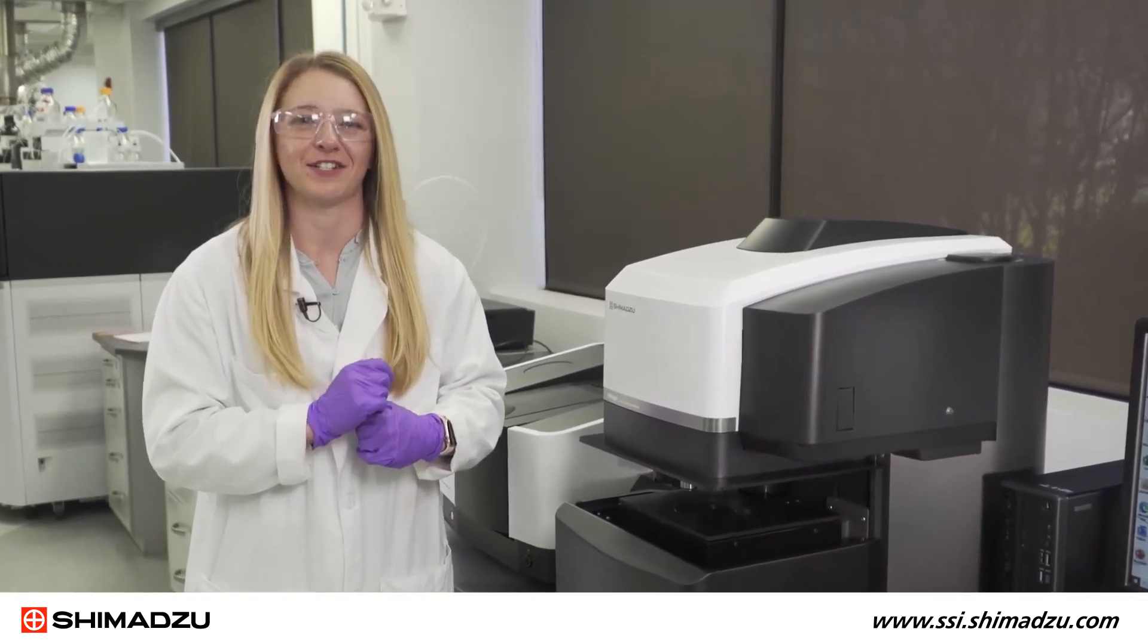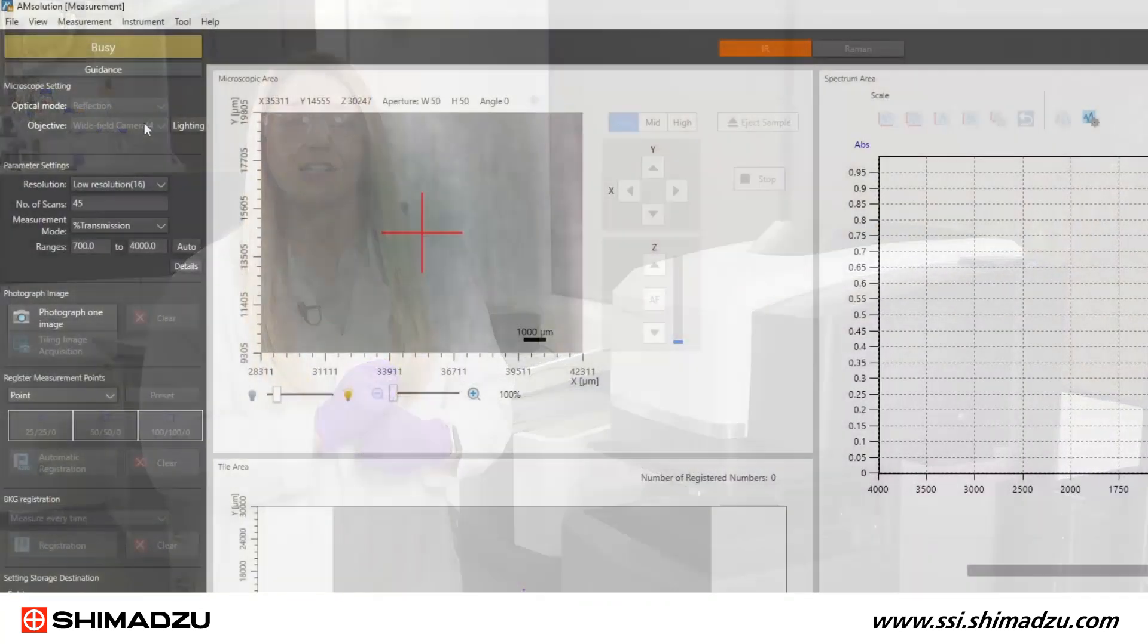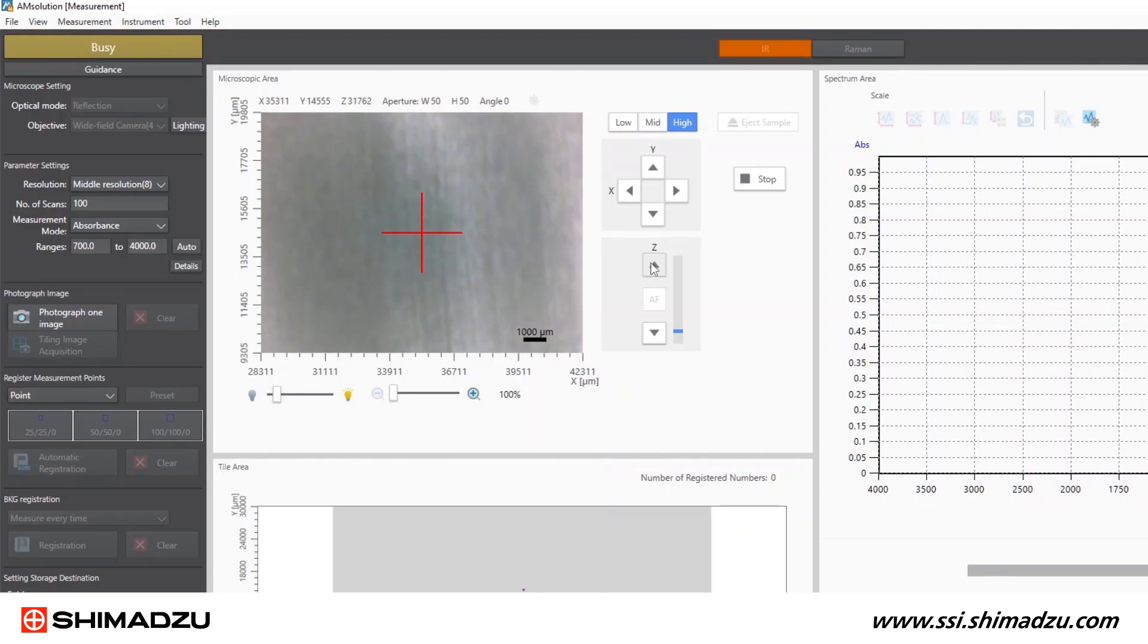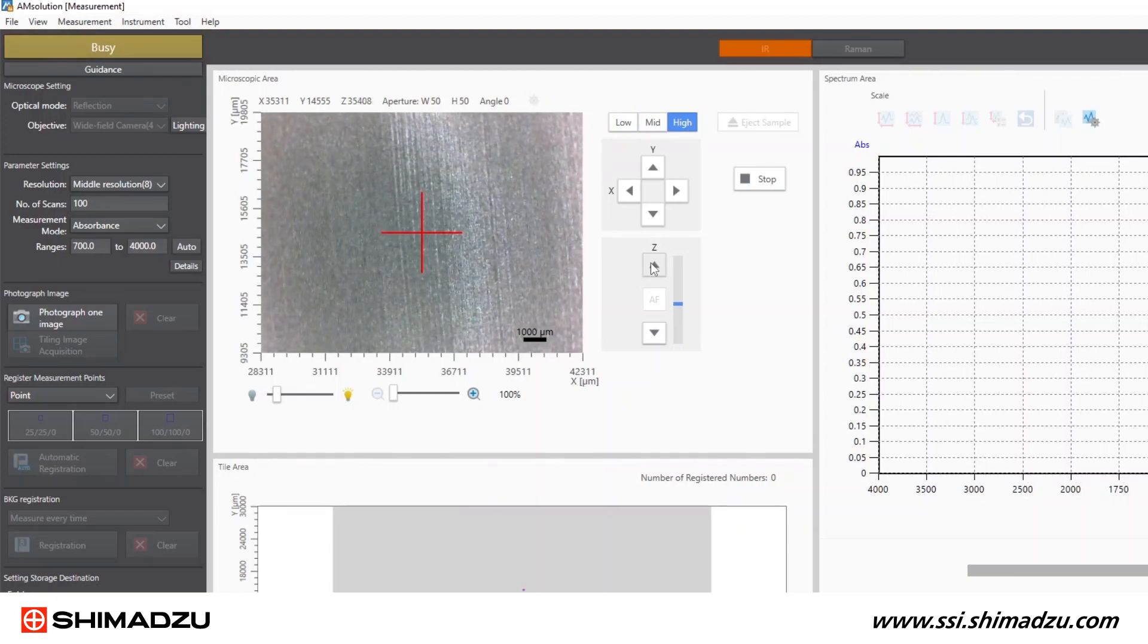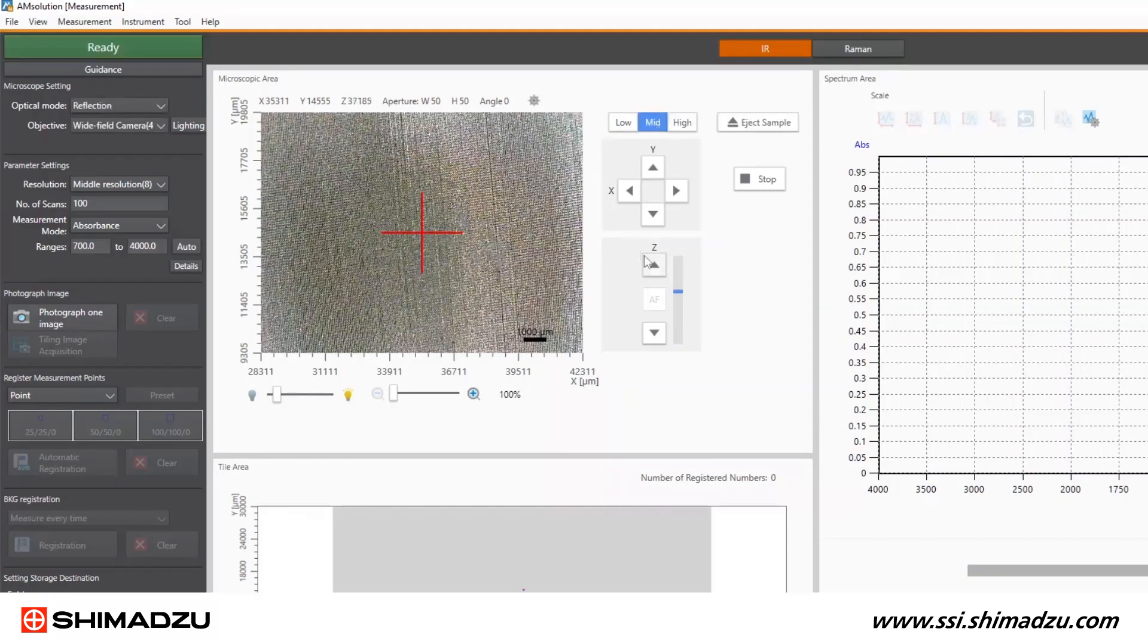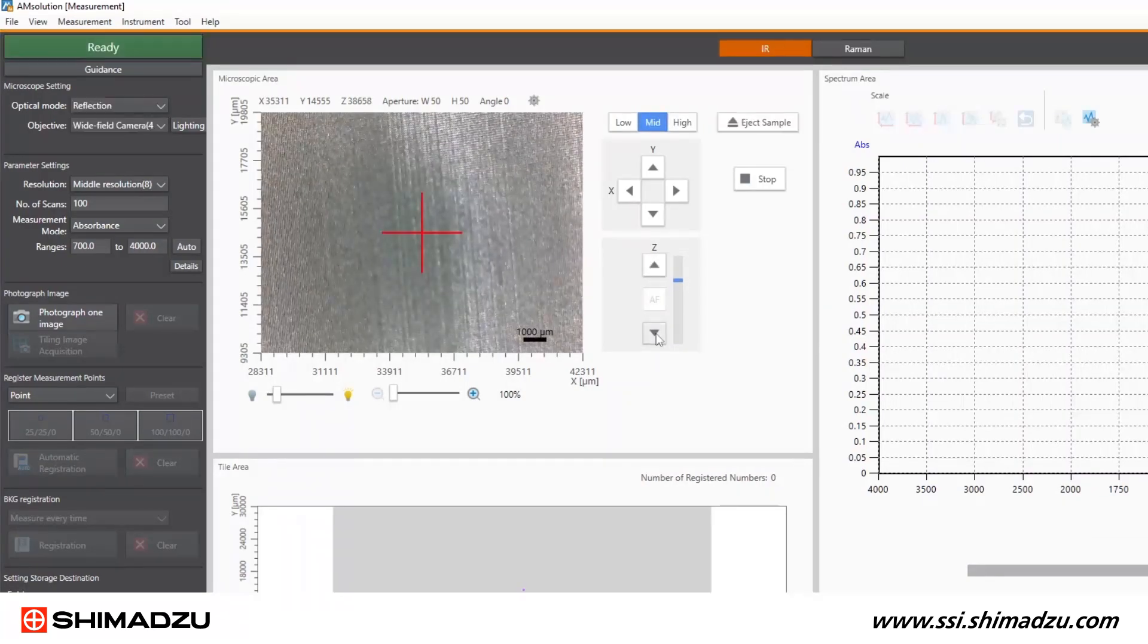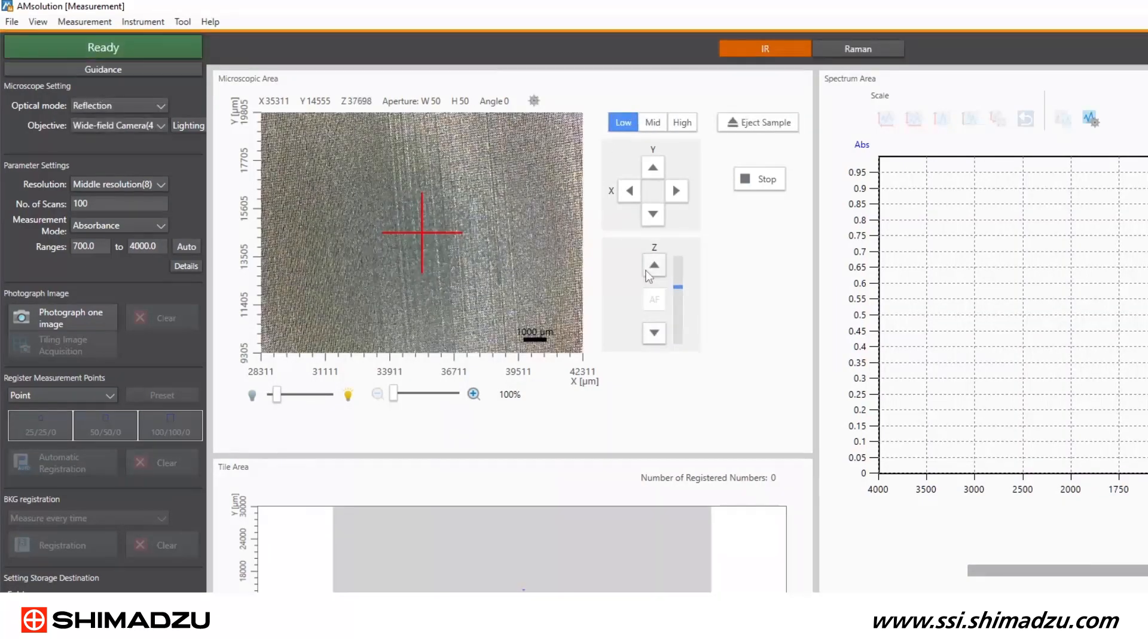Now that all of our FTIR parameters are ready to go, I need to find some interesting spots to measure. First, I select the wide field camera from the objectives dropdown list and use the Z height adjustment to focus on the sample and get a clear image. This is looking pretty good. Can you see any microplastics yet?